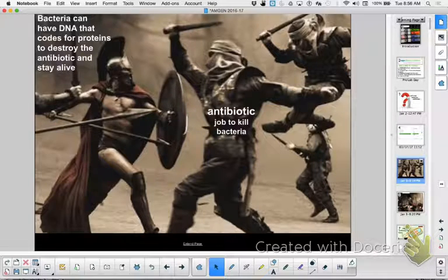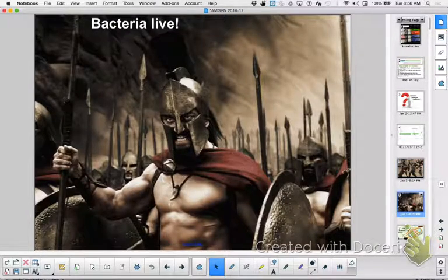So some bacteria are resistant to antibiotics. As long as they have those genes, then the bacteria will live. They can survive. This is a commonly used tool in genetic engineering because it's a way to select. Whatever gene it is you're interested in, it's not like you're trying to make all these antibiotic-resistant bacteria, right? That doesn't sound like a wise thing to do. But it's a good way to select. If you put another gene of value to you right next to that gene, then if they have the resistance to the antibiotic, they also have the neighboring gene that you've attached to it. So that's one of the things we're going to look for in the lab.